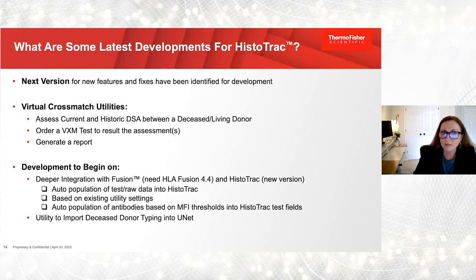We are doing virtual cross-match utilities. With some UNOS changes, this is a very hot topic within HLA. These utilities will allow you to assess the current and historic DSA between not only deceased donors, but also living donors. It would allow you to order a virtual cross-match test to result out these assessments and then generate a report.